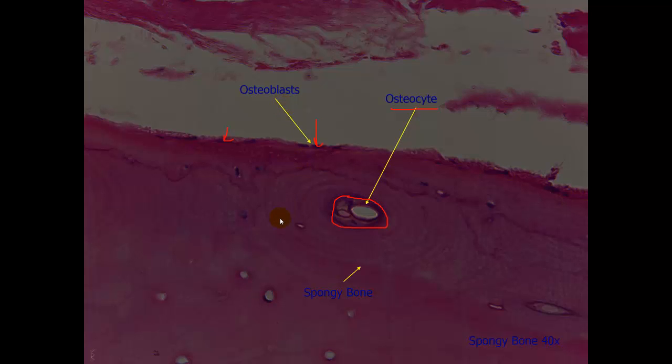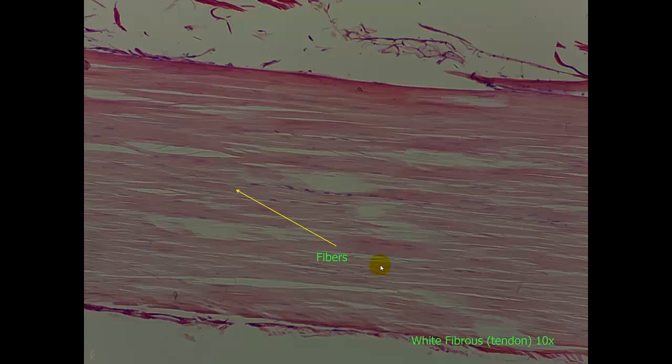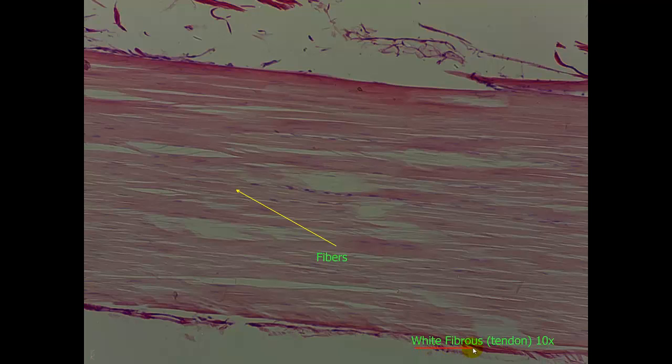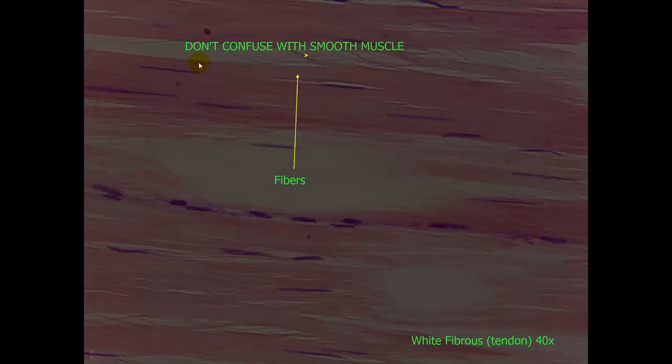Here is a dense regular connective. This is white fibrous. This is from a tendon at a 10x objective. We can see the nuclei of the cells. Those are the purple dots. We can also see the fibers that are running in this direction, which is along the area of stress, which would be running from left to right. One thing that I've seen with students is that they confuse this a lot with smooth muscle. Please don't make that mistake. These are not the fusiform shape. We will look at smooth muscle in another video.